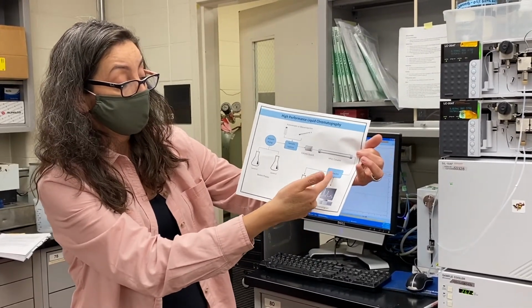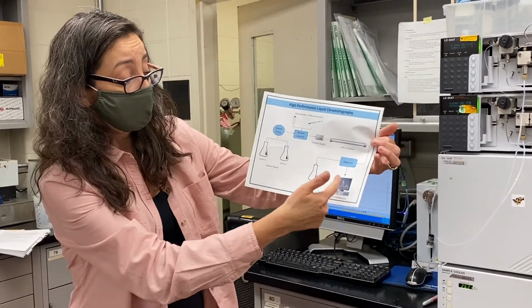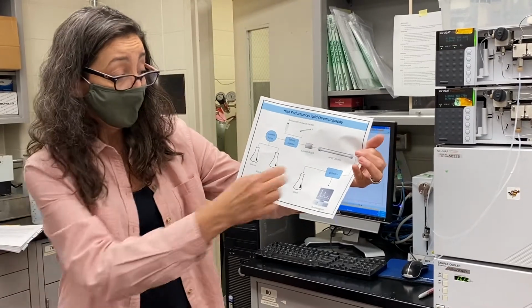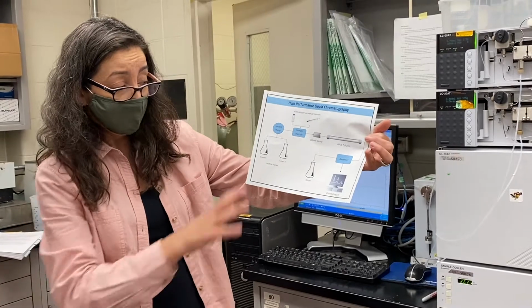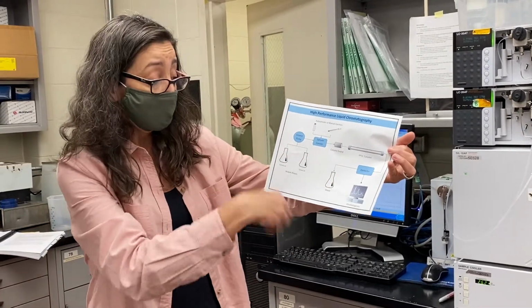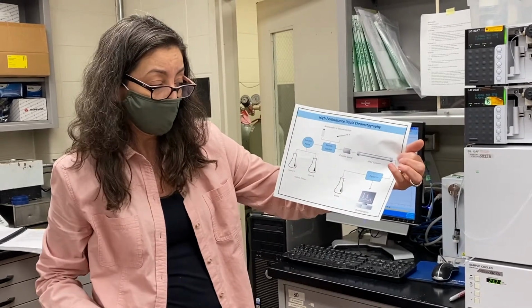As the sample goes through, every component is going to give you a signal, and then you'll have a chromatographic peak, and we're going to integrate those chromatographic peaks. After leaving the detector, it will be going into the waste, or if we need to collect the sample for further analysis, we will collect it in a tube, and it goes for different types of analysis.